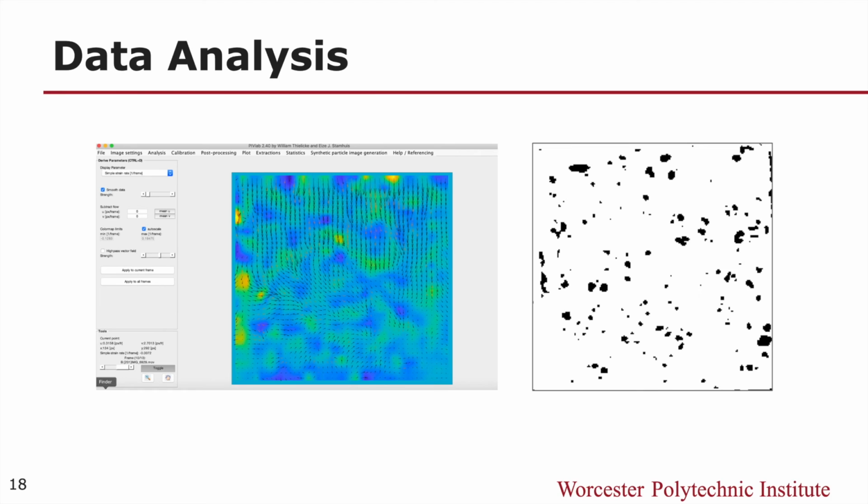From here, in order to gather data from all our gels that are being stretched, we spread graphite powder in the gels that do not contain aggregates. The fine powder is sifted onto the gel and creates a pattern that can be used for strain distribution. We then use a macro lens and image the gels once a day for a 7-day period, and from each day, we get at least 10 images.